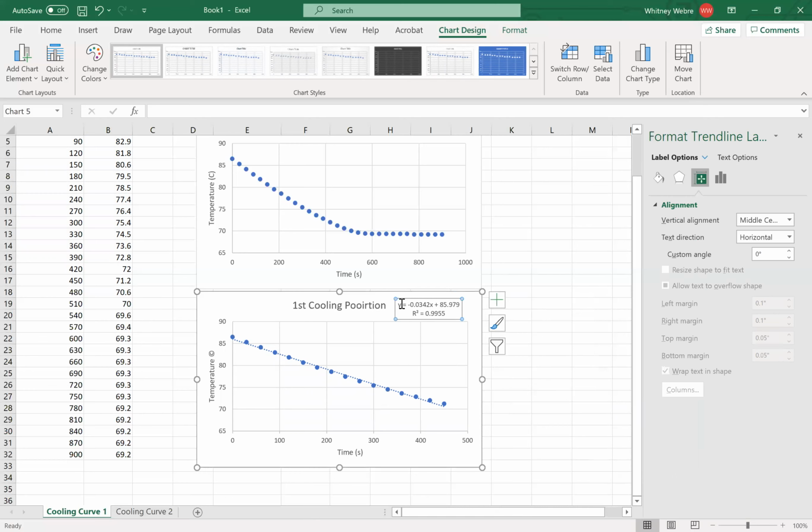And then this is going to be our equation that we're going to be using for our lab report in LabFlow. So when it says what is your y-axis, it's going to be this number. Our slope is here. And now you can continue on with everything else.